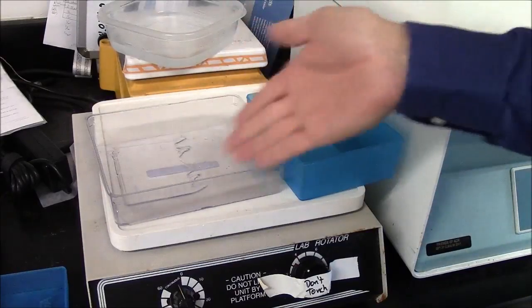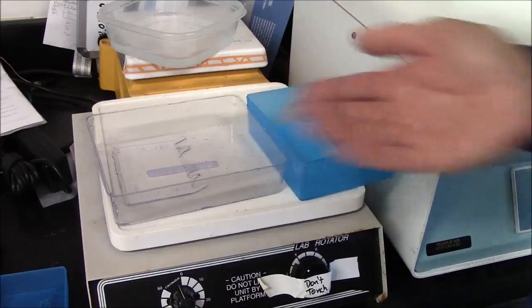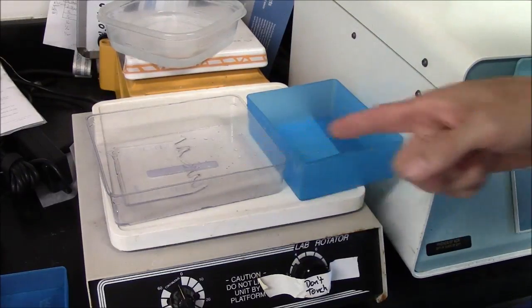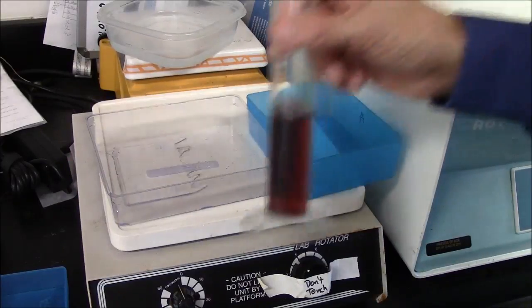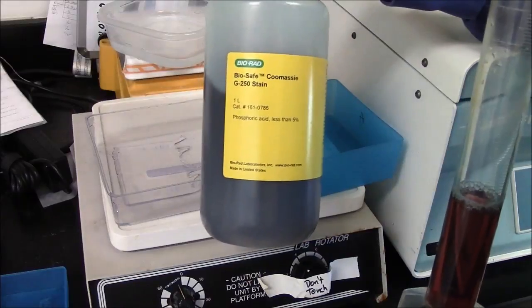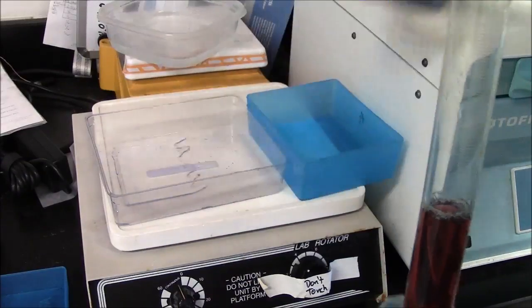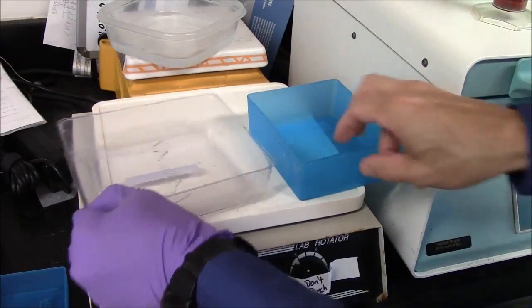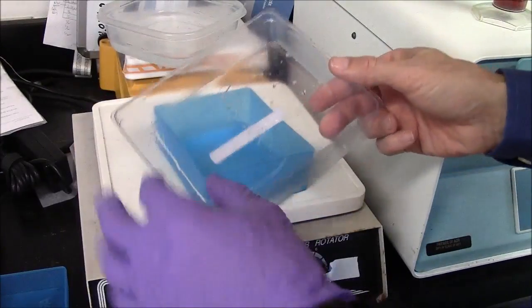I have rinsed this gel twice for about 10 minutes each time with distilled water, 100 to 200 milliliters. And now I want to stain it, so I'll use this stain here, which comes from Bio-Rad. And I use about 40 milliliters, but I need to transfer the gel to a smaller vessel so that the 40 milliliters will cover the gel.